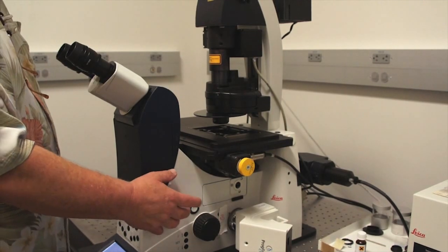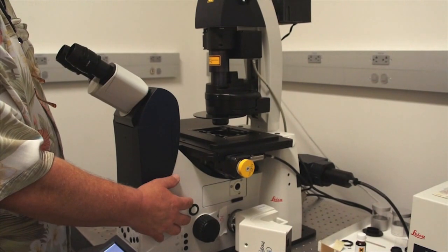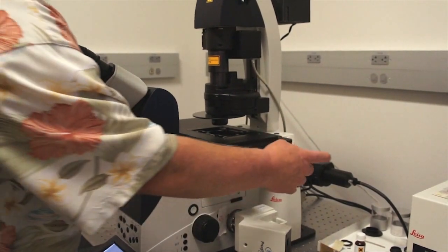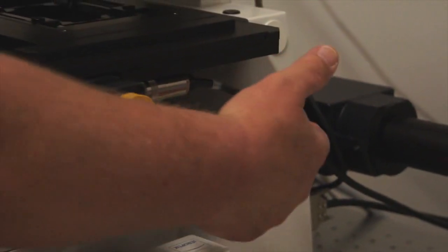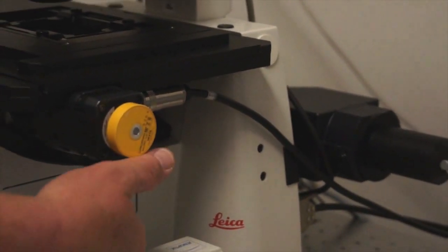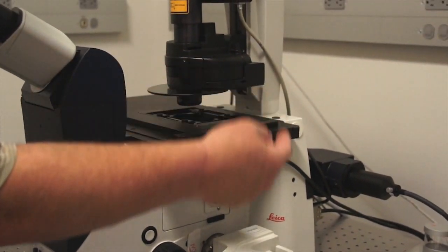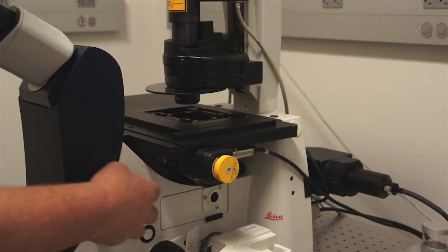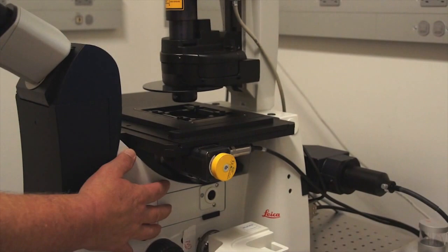We discussed epi illumination, which is light from above for the fluorescence microscopy application. Here we have an illuminator which is supplying the fluorescent light, and again it comes in below the stage. It is epi in that it does come through the optics and reflects off the specimen and back down through the optics and then transmitted into the microscope, but it is reversed because this is an inverted microscope.